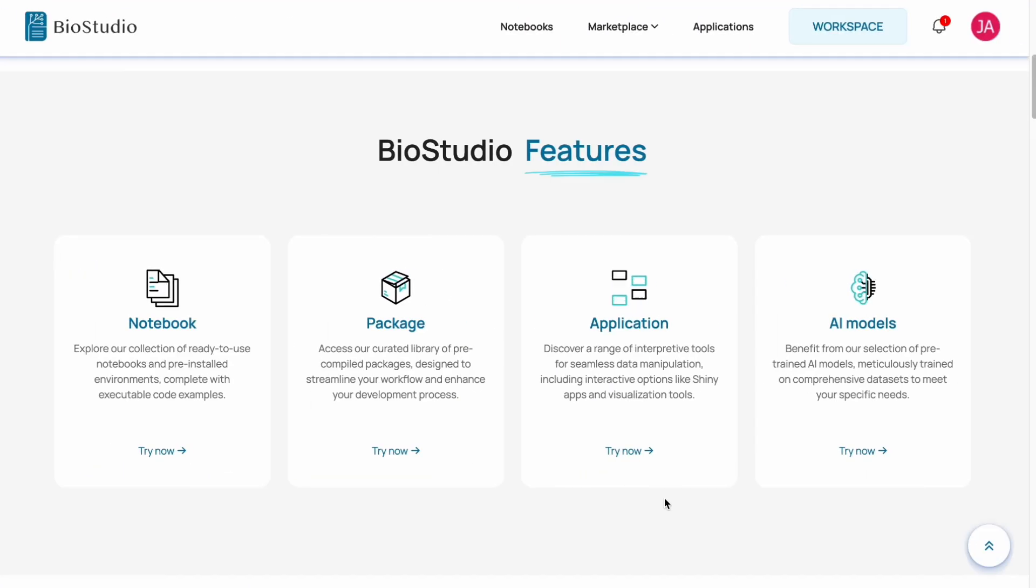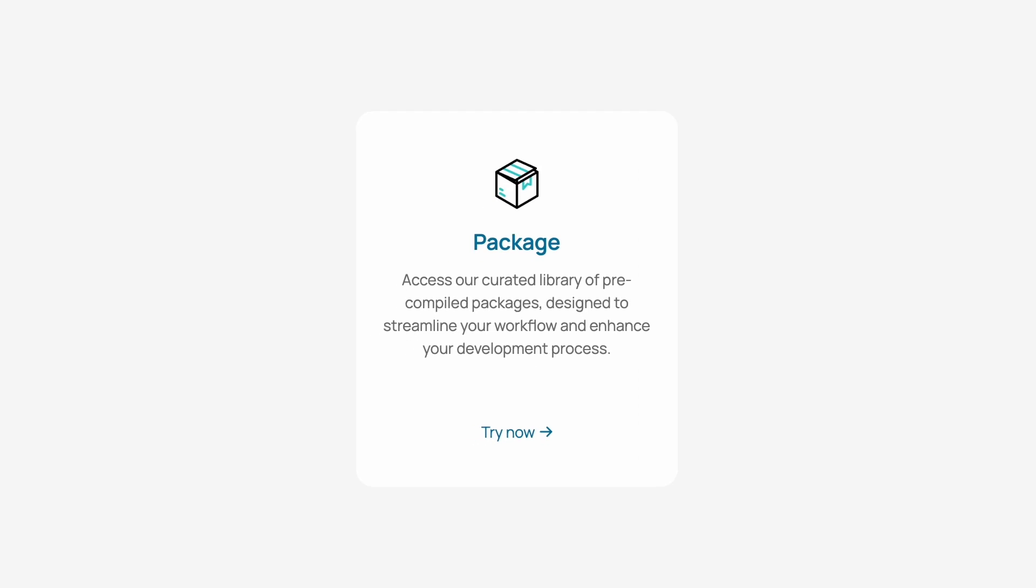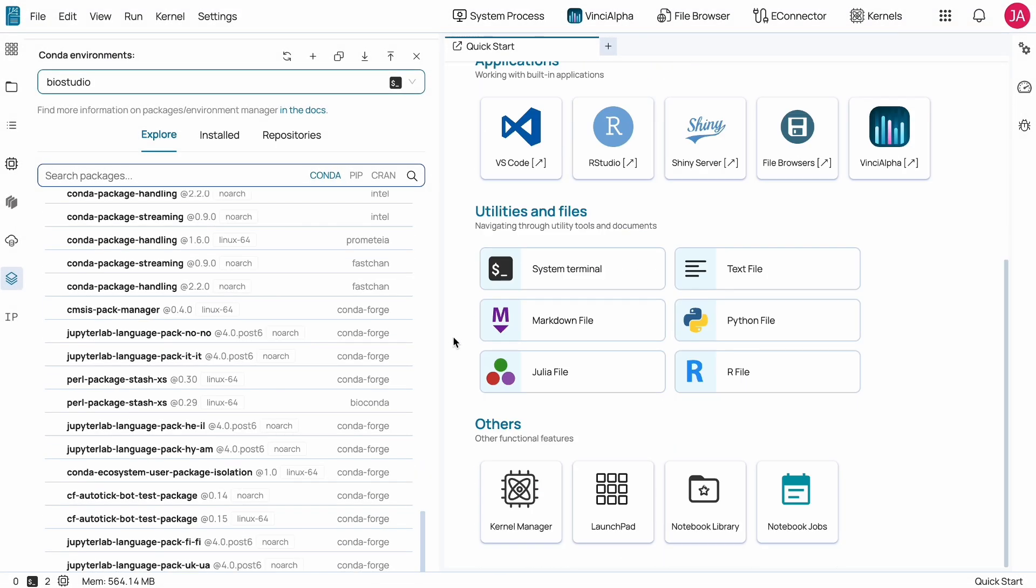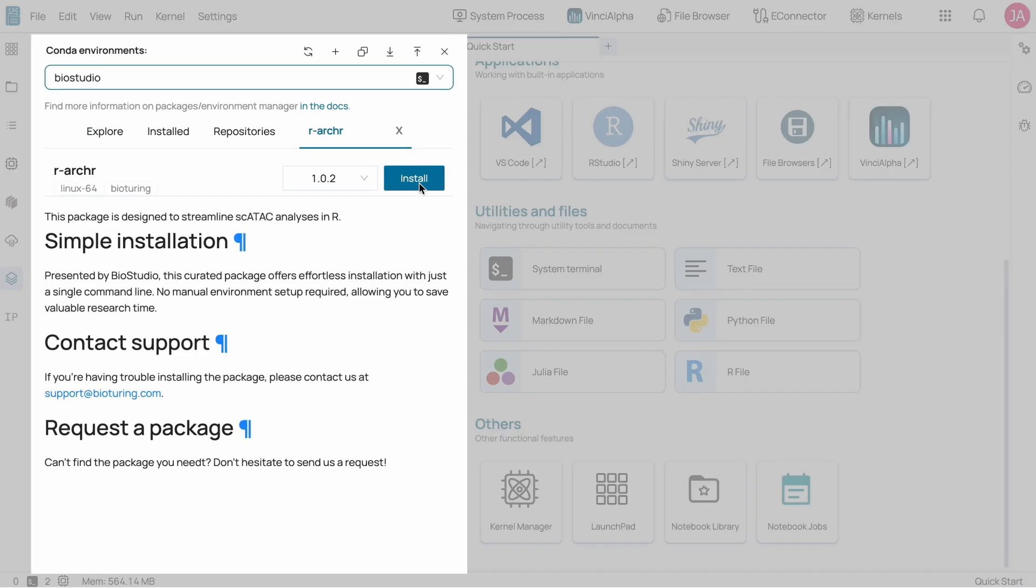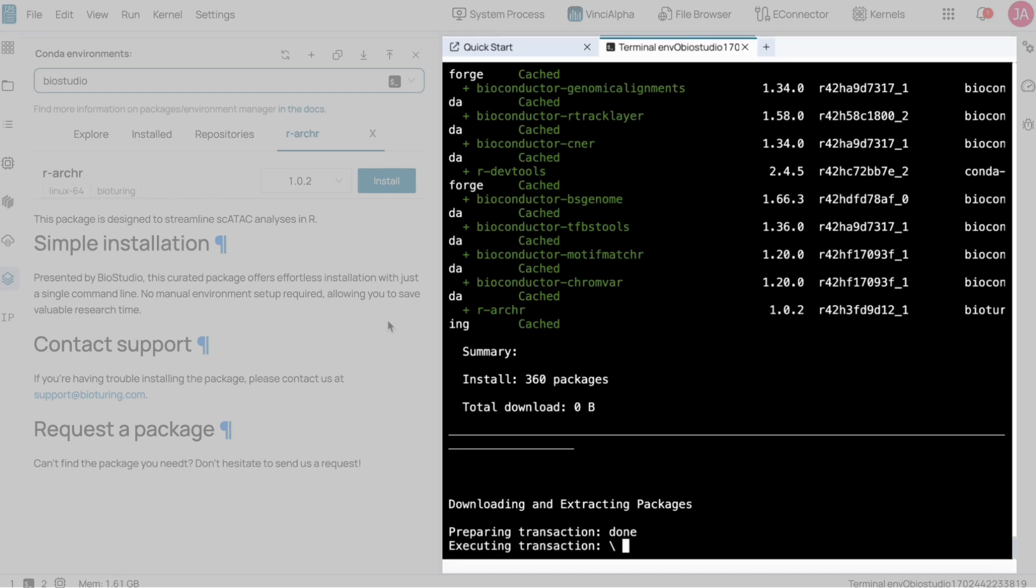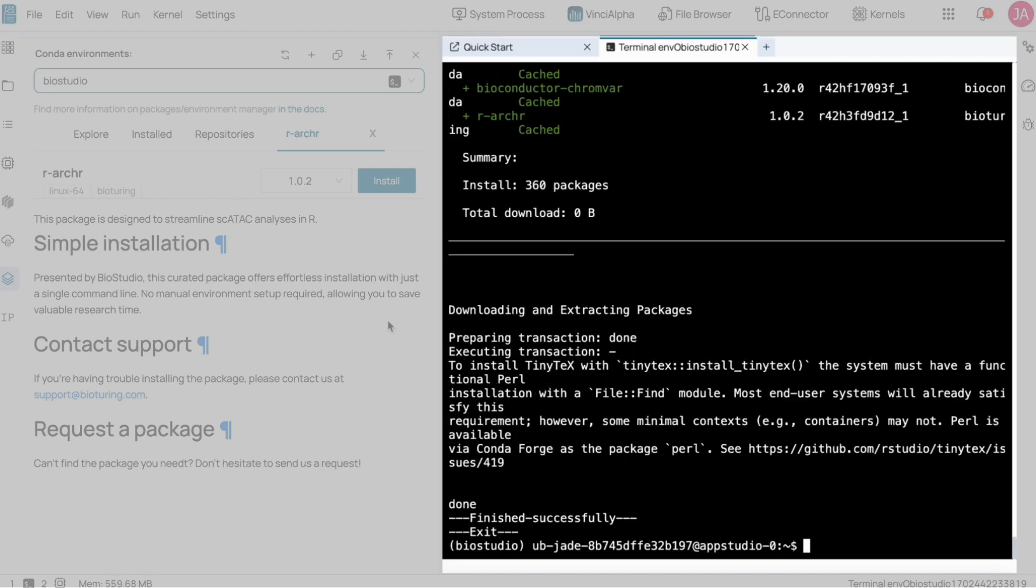To work with your pipeline, curated library of pre-compiled packages is designed to streamline your workflow and enhance your development process. With a single click, the package is automatically installed without the need for coding.